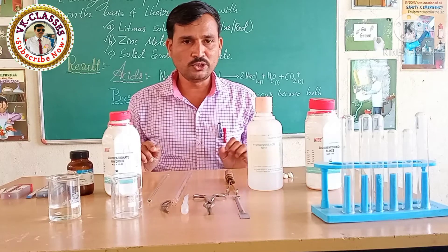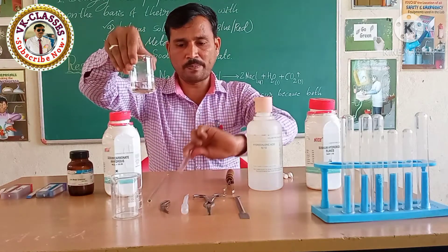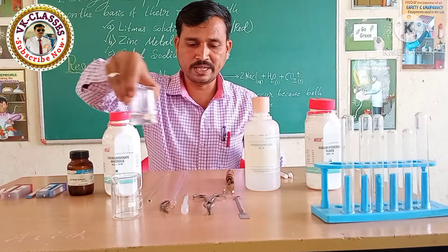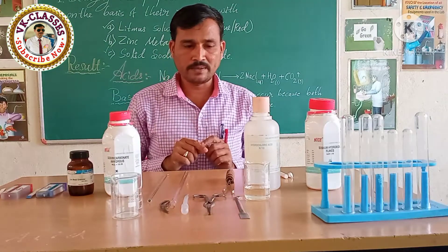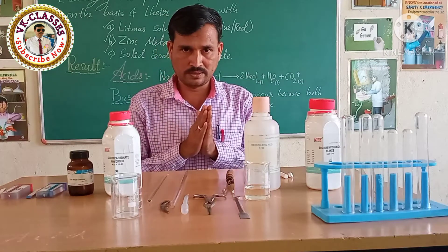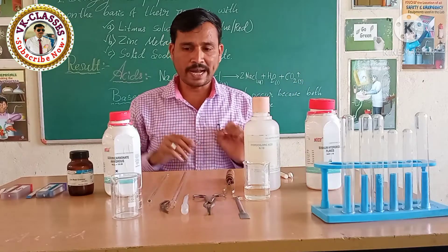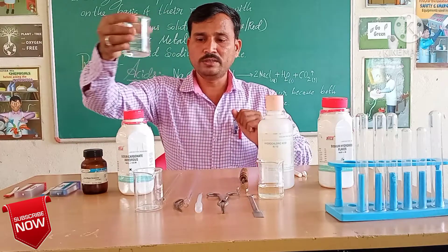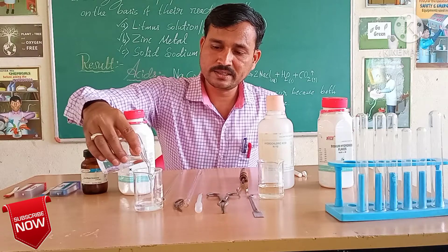We will prepare the solution of sodium hydroxide. I took, with the help of a pipette, 40 ml of dilute hydrochloric acid in this beaker. Now we will prepare sodium hydroxide solution as the base solution. I will add a little distilled water, or demineralized water.